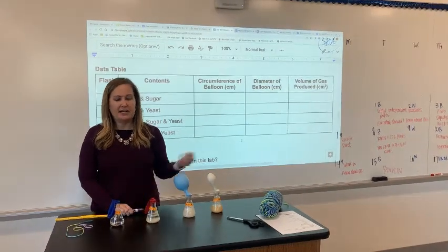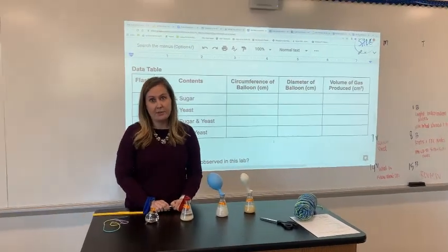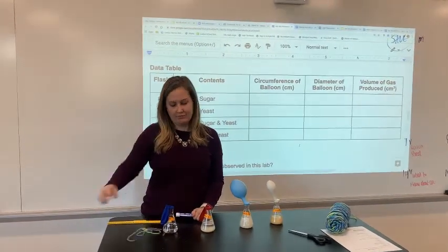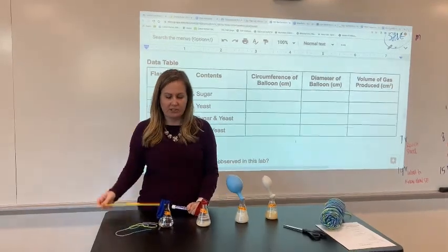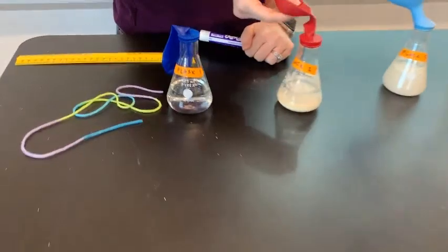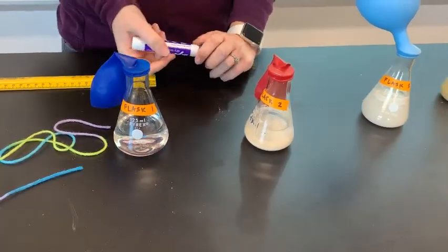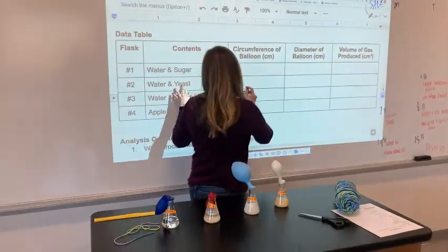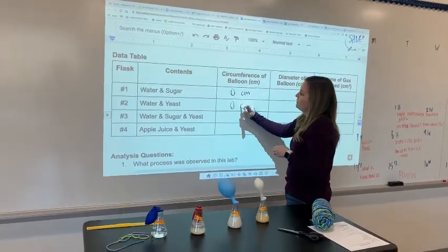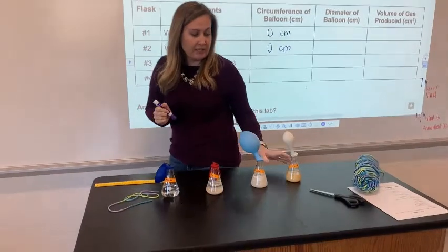We let our flasks sit overnight, and today we're going to measure the circumference so we can find how much volume of gas was produced from each experiment. To do that we have a piece of string and a ruler for measuring centimeters. As you can see, for flasks one and two there's no gas in these balloons at all — no reaction occurred — so for their circumference I'm going to put zero centimeters since nothing was produced; the balloon is still the same size.